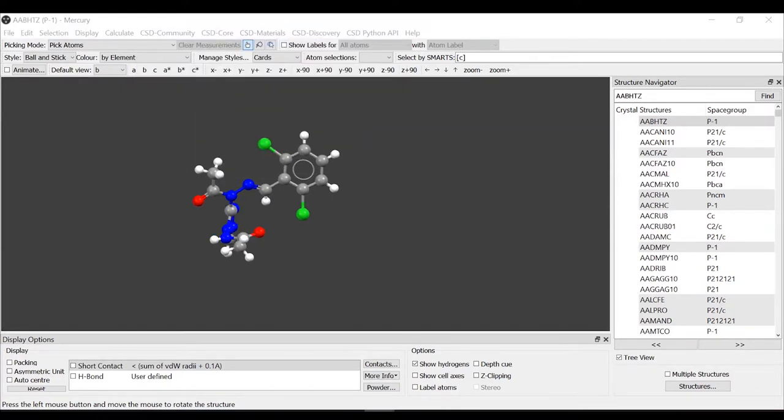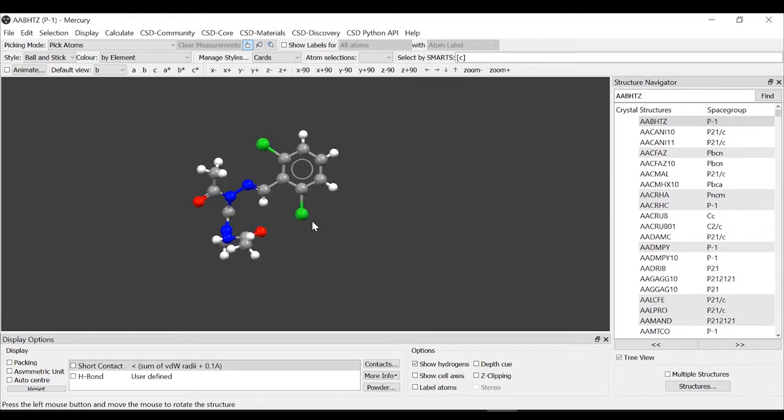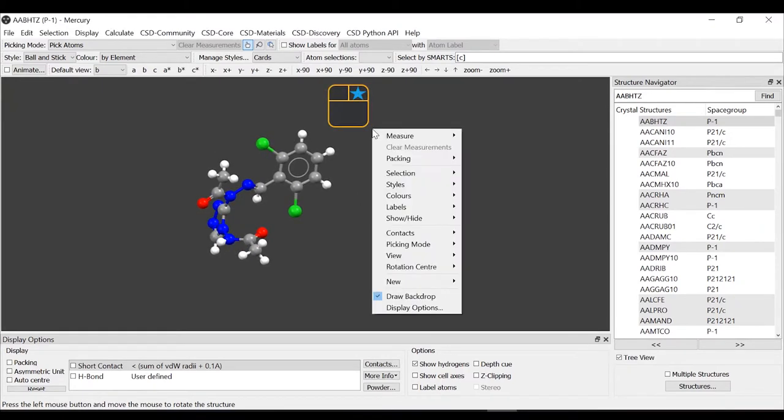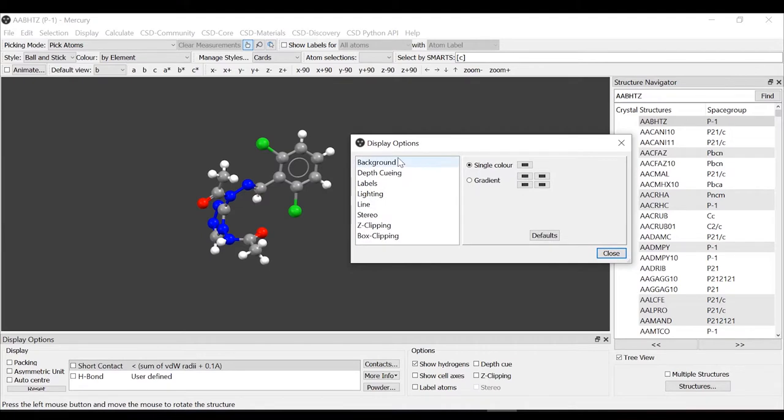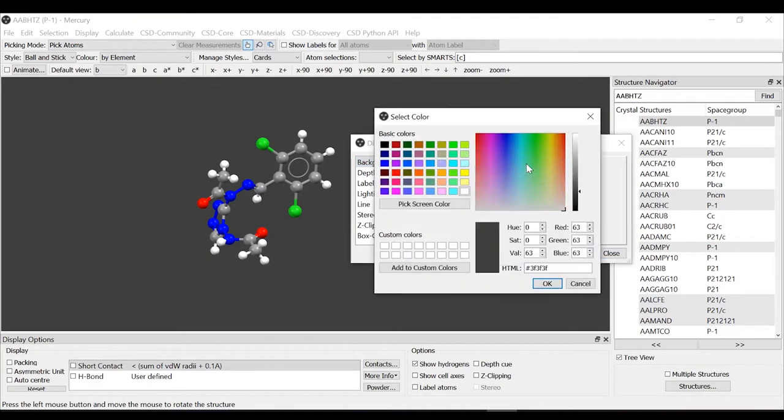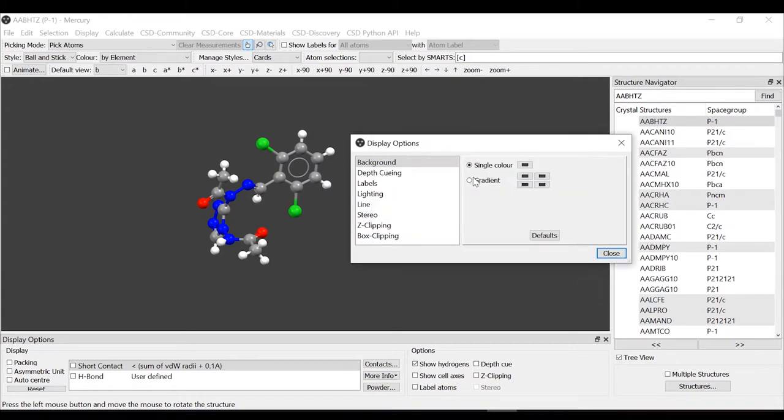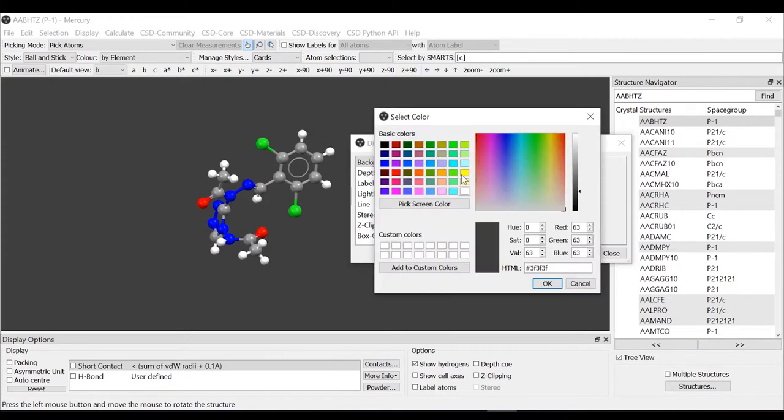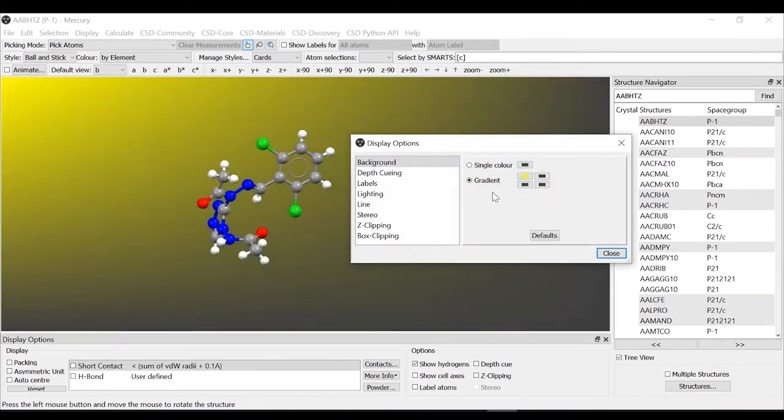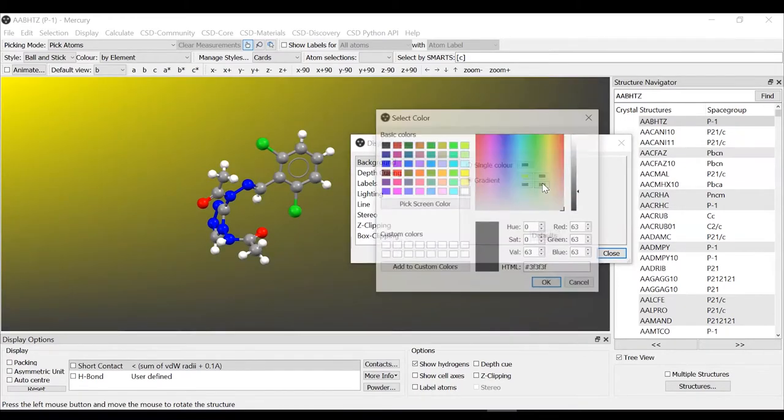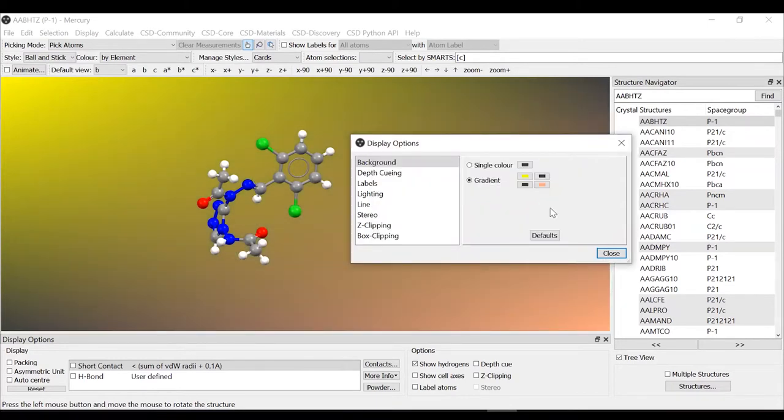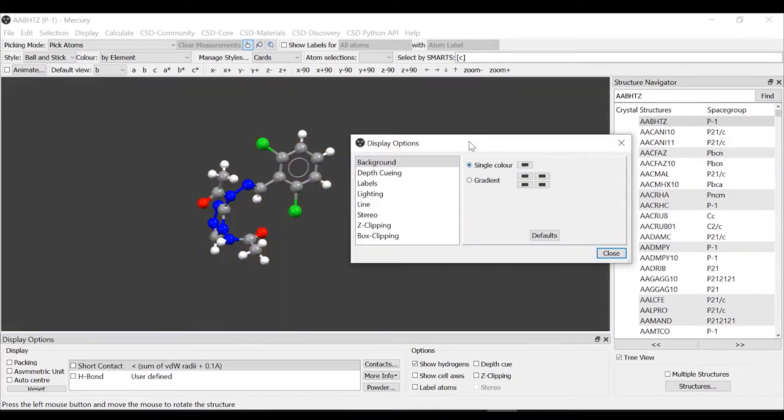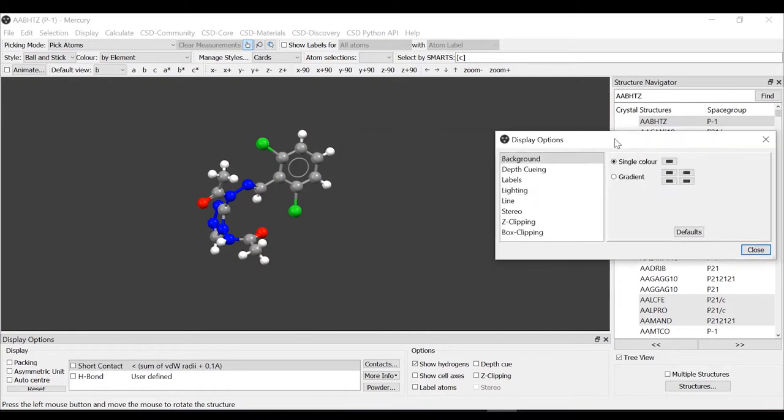Another thing I want to show you is how to change the color of the background. You can right click here and go to display options, then from the display option background, you can select whether you want a single color or gradient. You click on the color and you have a pop-up with all the colors. For the gradient, each of the colors here represent a corner. I will go back to the single color.